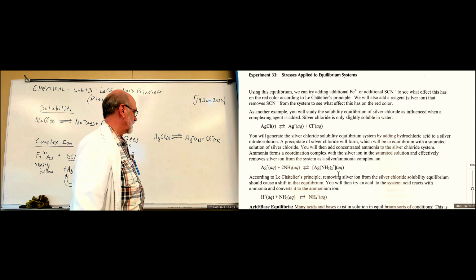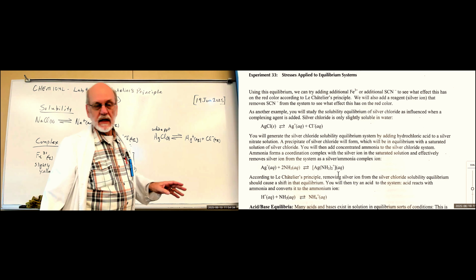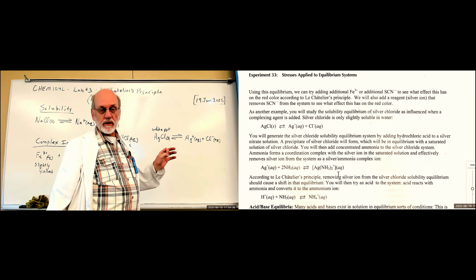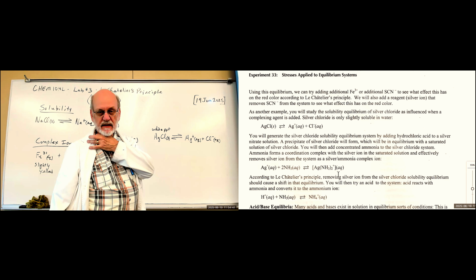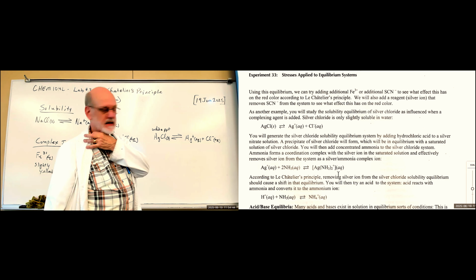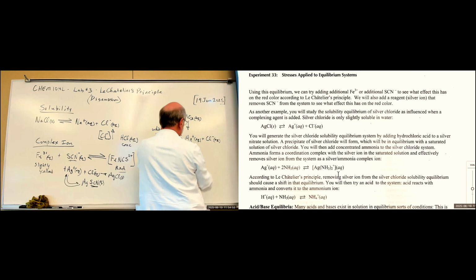Now, we can see this as a precipitate, a white precipitate. These don't have a color. In order to, let's see, this is going to be derived from silver nitrate, which is completely soluble. So we're going to have this in solution.